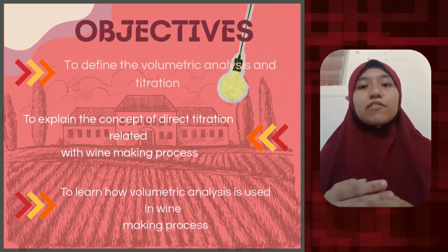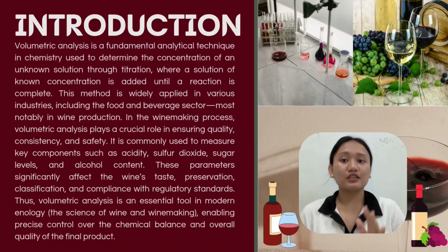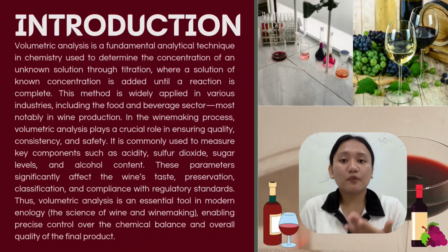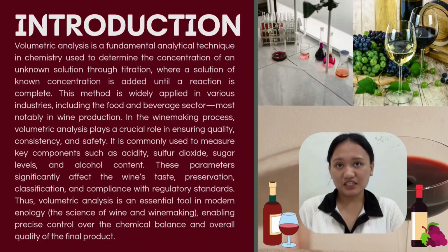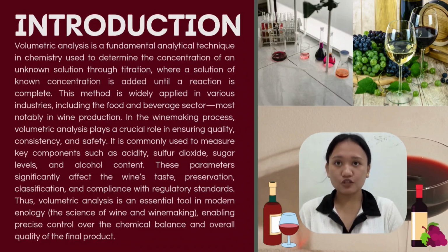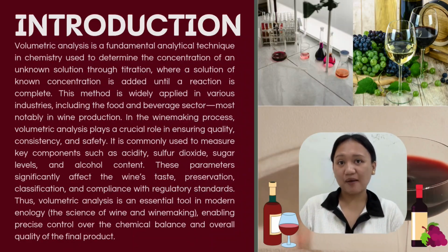Now, let's move on to our introduction. Moving on to my part, which is the introduction, I will briefly introduce you to our topic that we are about to discuss, which is volumetric analysis in application of wine. So, volumetric analysis might sound fancy, but it's really just a smart way to measure how much of something is in a liquid, like when we do titration in the lab.